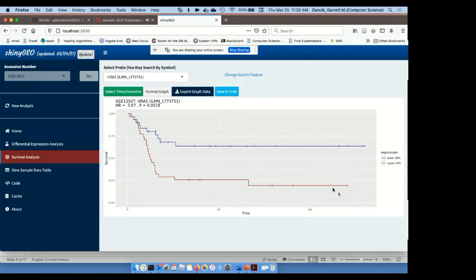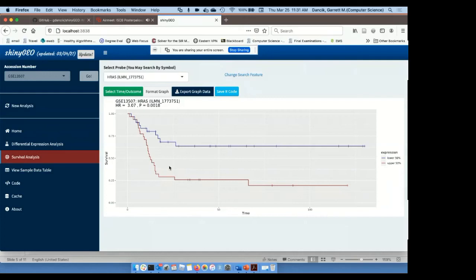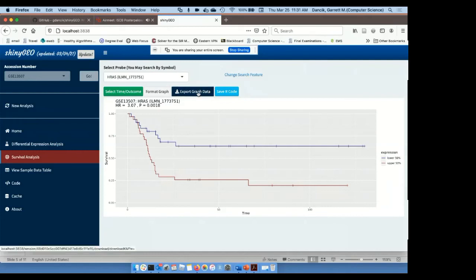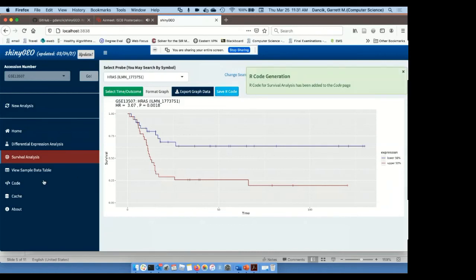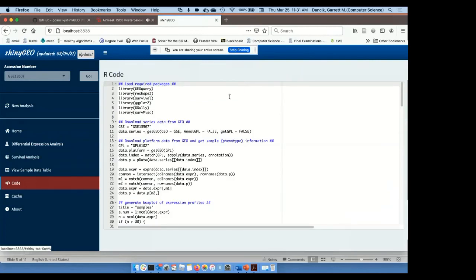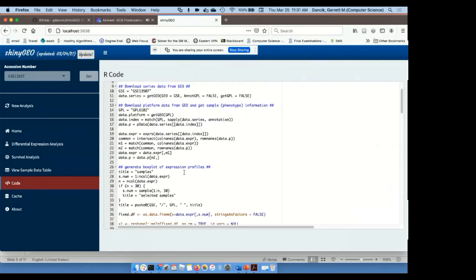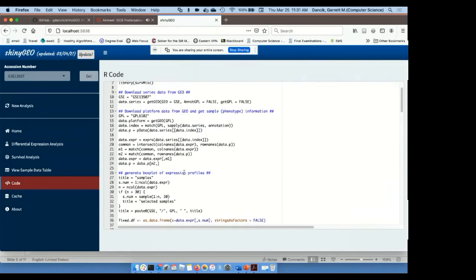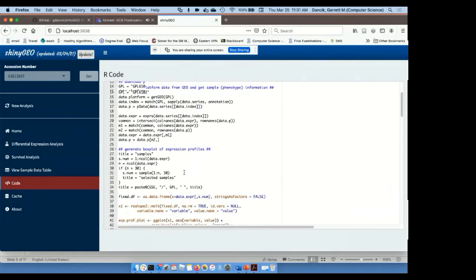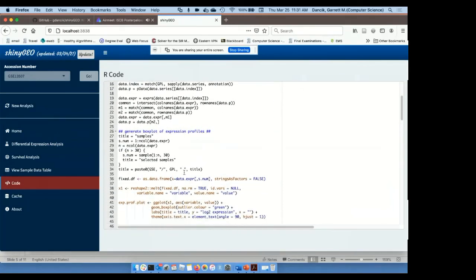And we see from this result that high HRAS expression is associated with poor outcome in bladder cancer patients in this data set. High expression is relative to the median, so we're looking at upper 50% versus lower 50%. The hazard ratio is 3.07, and then the p-value is statistically significant. And I can format the graph. I can export this graph data. I could also save the R code, which I'm going to click on. And if we want to look at the R code, we can go to the code panel. And we see the R code that was used to both download data and process the data.